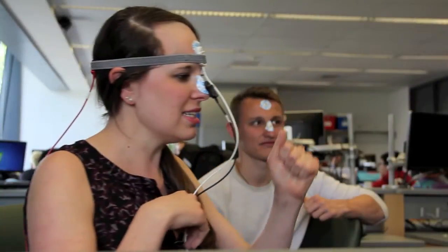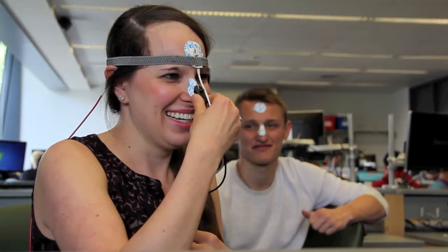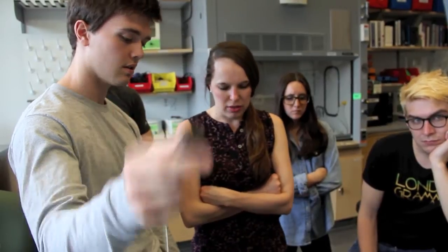Okay, thanks guys, looks great. I am Shauna Dorsey, I am the professor for this course, which is our junior level lab. In here it gets really exciting as they're getting the opportunity to use biological systems.